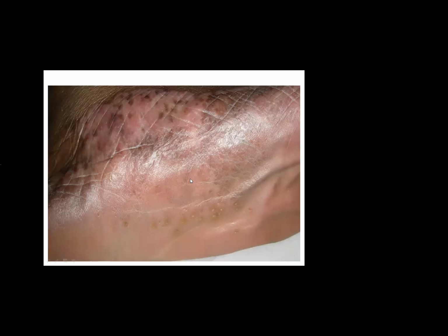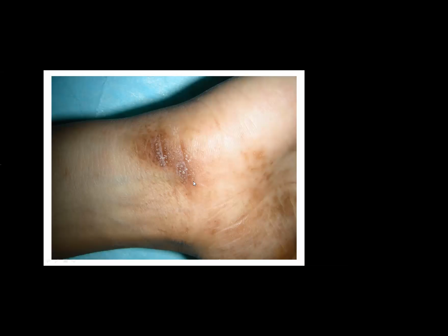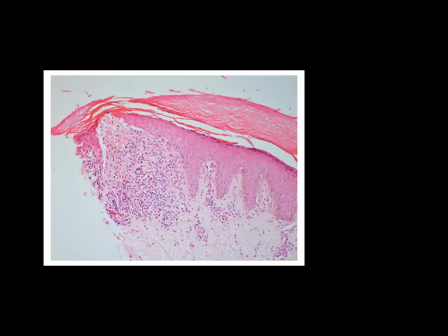They can also be seen on the wrists, and we have seen that this morphology occurs independently or occurs in association with evidence of lichen planus and lichen nitidus elsewhere on the body. And consistently, these pits, when biopsied, show a lichenoid tissue reaction.